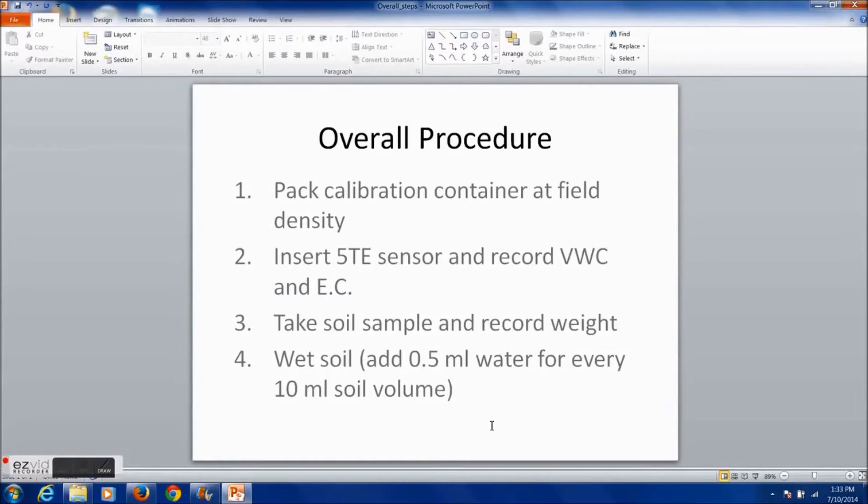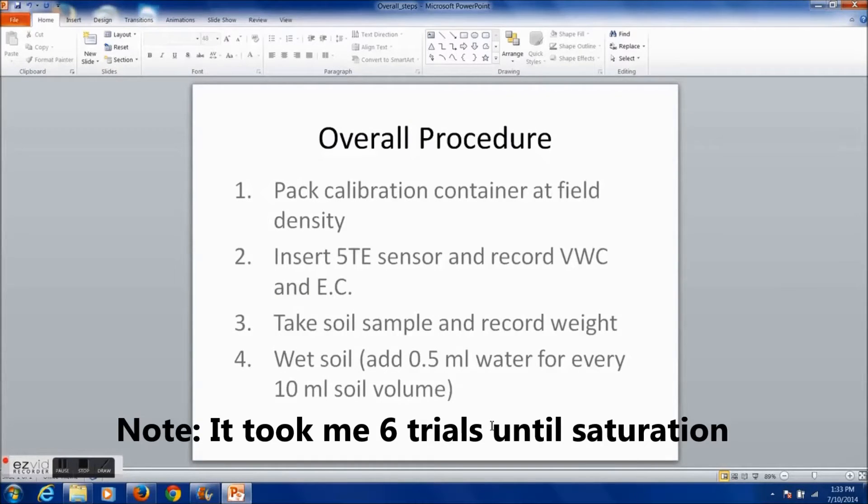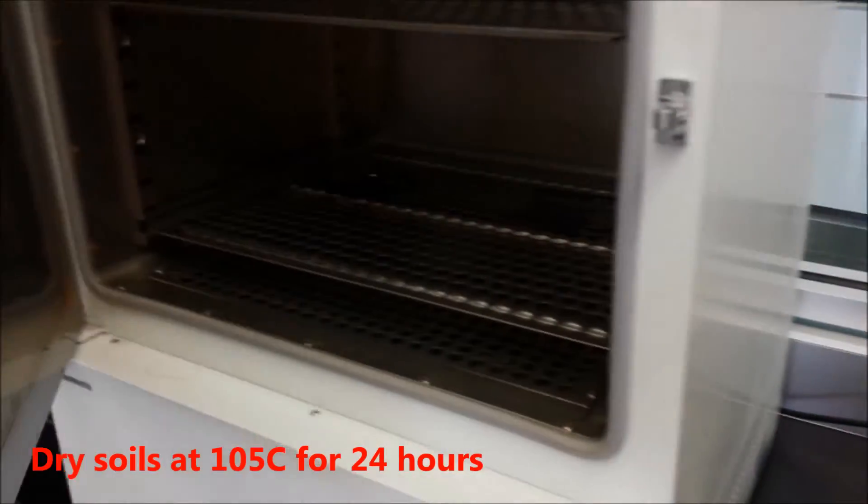Shown now are the overall steps to the calibration procedure. Repeat this process until the soil reaches saturation. Once you have taken 4 or 5 different samples, you are ready to begin drying the soils.